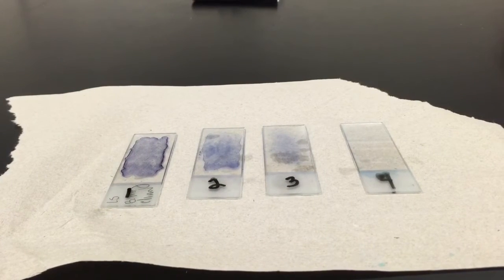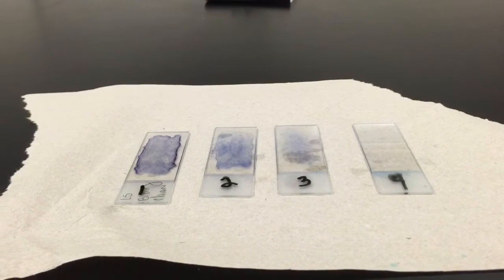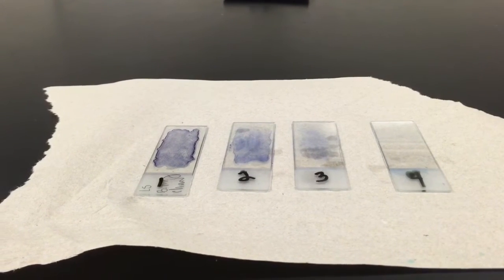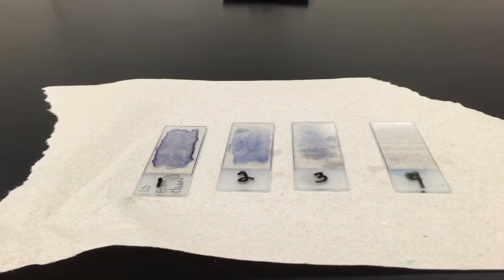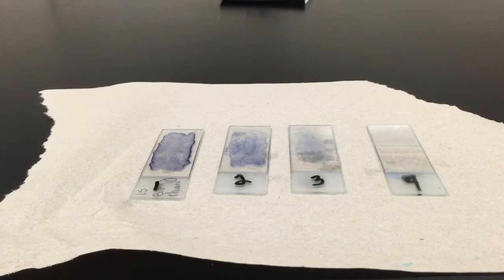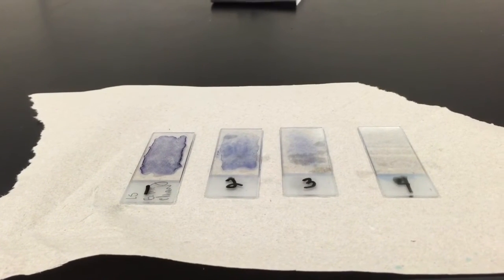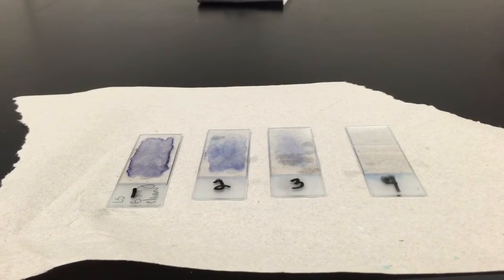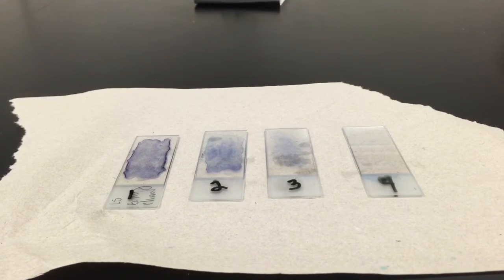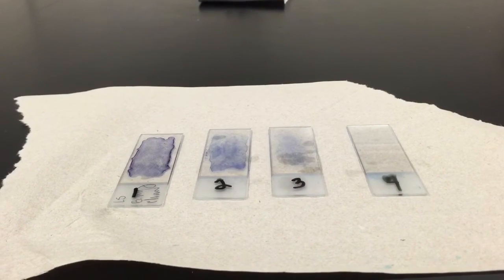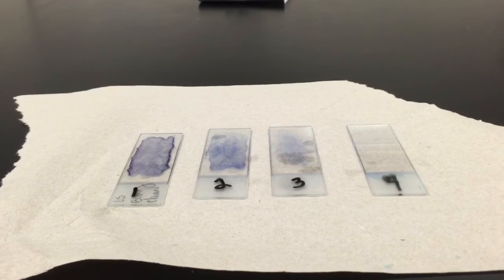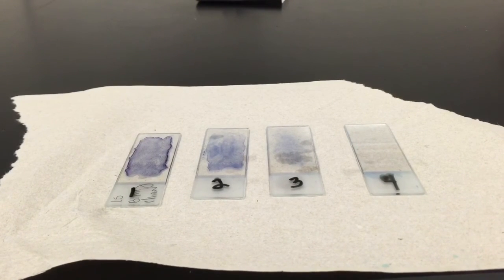Okay, let's take a look at my results here after staining. Slide number one, way too much material on it. The smear is too thick. You might think of sardines in a can. We're going to have layer after layer of cells stacked upon each other and so it's going to be difficult to make out individual cells. Slide number two, still too much material on there. By the time I get to slide three, we're looking pretty good. I think that's going to be a great slide. And then slide number four, you're thinking there's nothing on that one, but I'll bet you there is.